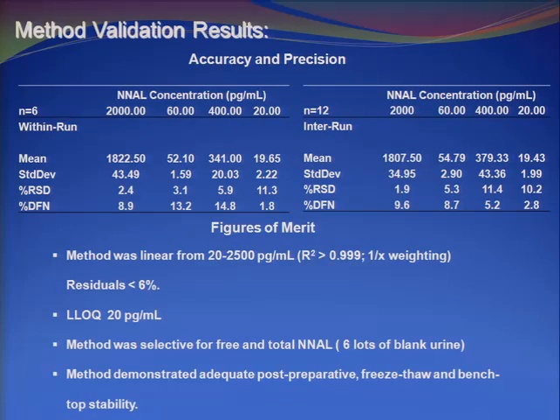This is the accuracy and precision validation results, within run and inter-run, down to 20 picograms per mL. And you see that the validation data is all very good and very tight within the FDA guidance, which was our target. Wide linear range, 20 to 2,500 picograms per mL, and a lower limit of quantification of 20, as I said. Selective in 6 lots, all of that stuff that's required by FDA.